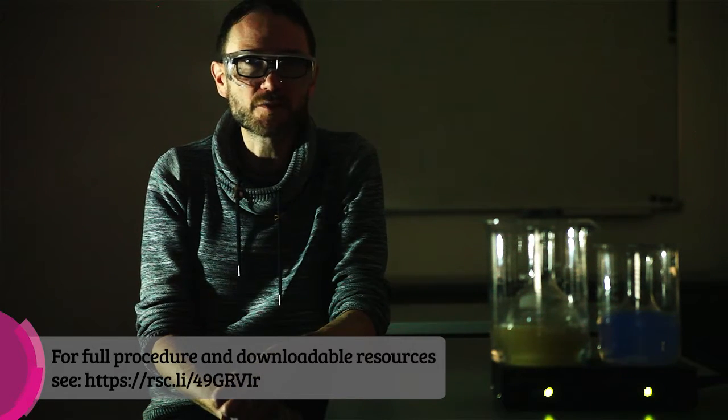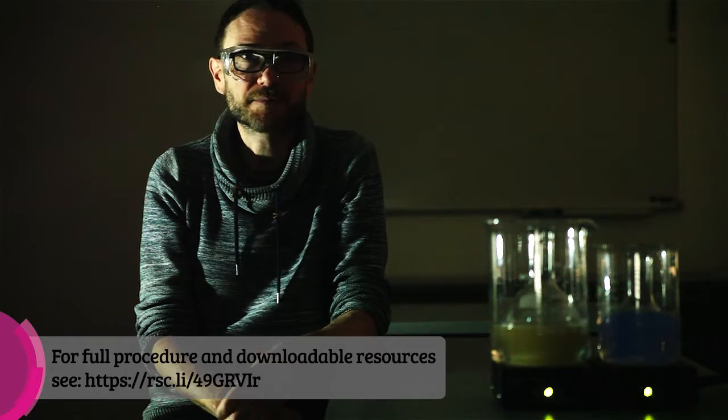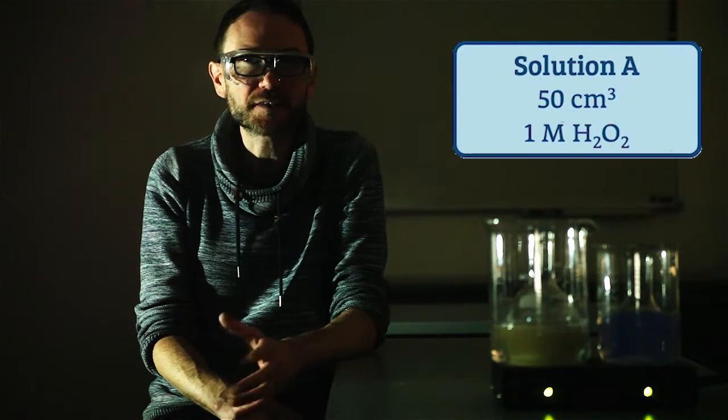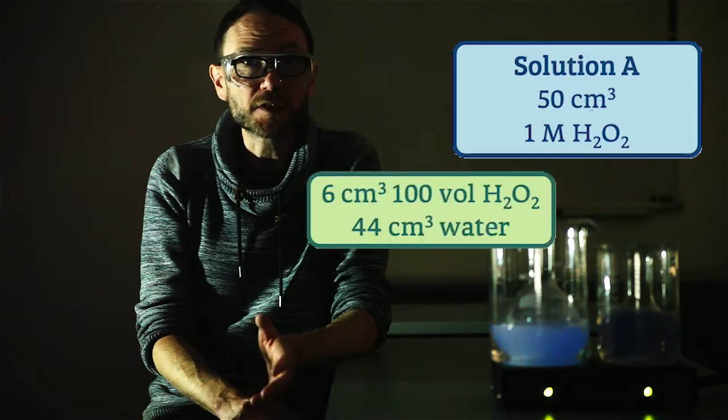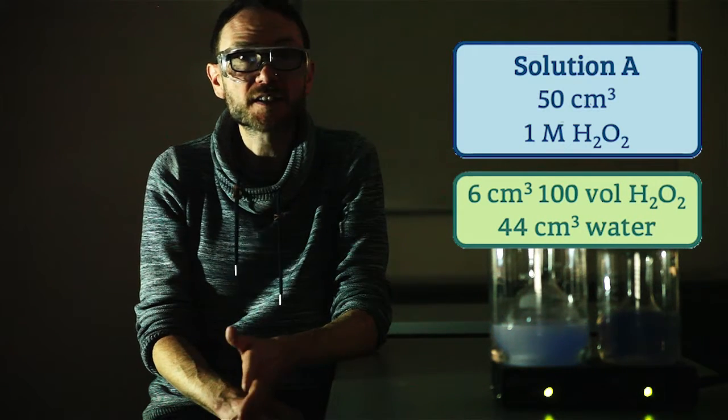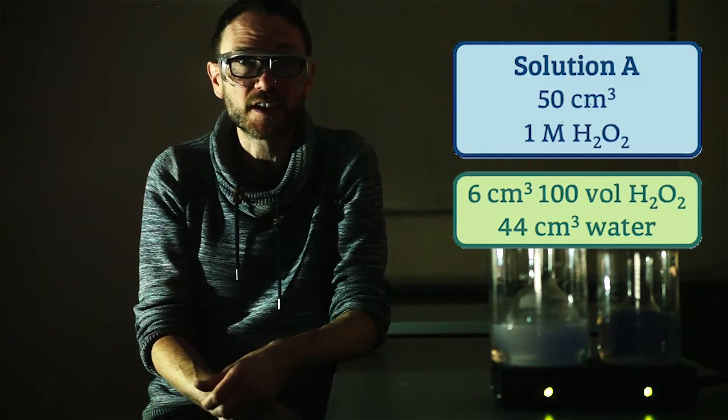We'll need four solutions, which I'll label A, B, C and D. Solution A is 50 cm³ of a 1 molar solution of hydrogen peroxide, made by adding 44 cm³ of water to 6 cm³ of your stock 100 volume peroxide.